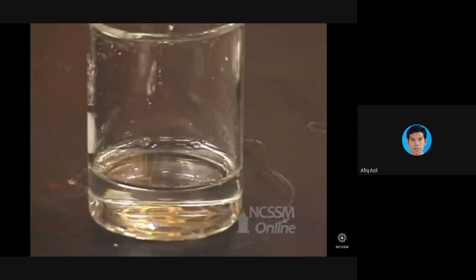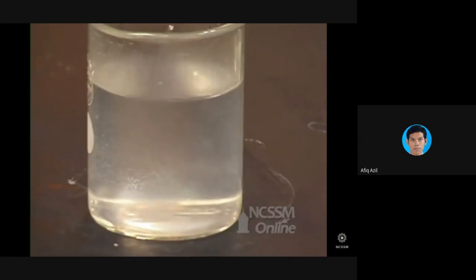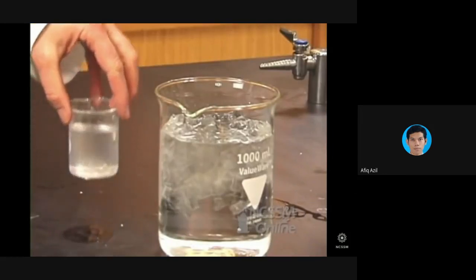Now we're going to add 60 milliliters of warm water. You see it gets cloudy? There's actually a little bit of crystallization that's occurring. You want to stir that. And now we get to wait again. We need to give this time for the crystals to form. So we're going to put it back in our ice water mix.